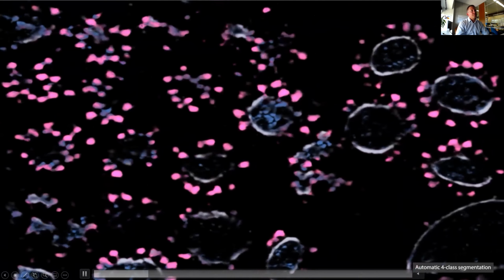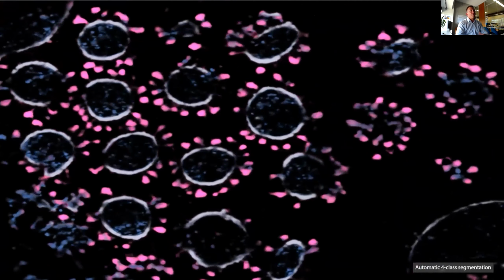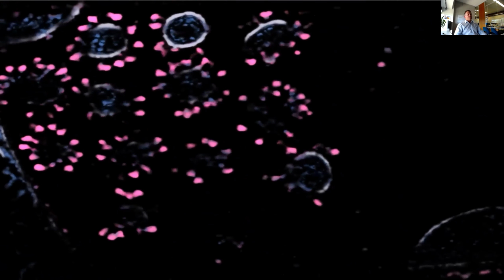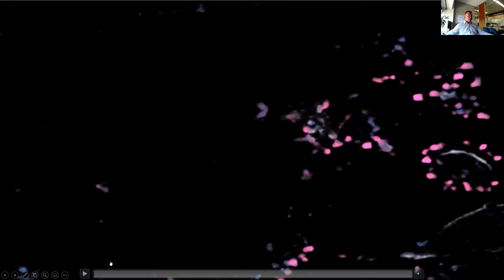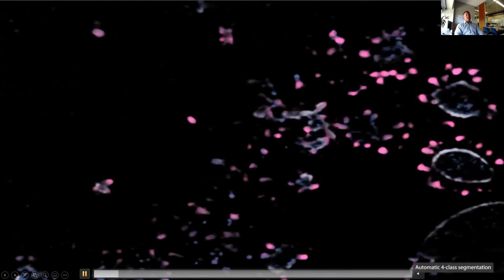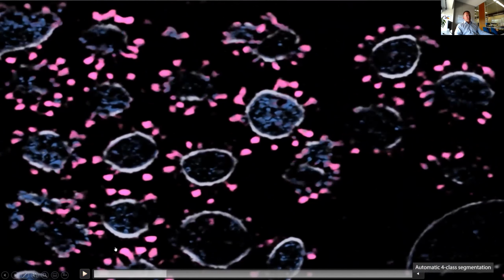Afterwards, this is an application of the segmentation on a novel set from these acquisitions provided by Tsinghua University. We can see that the segmentations are actually better than the pseudo labels which we have seen before. This has also been confirmed by the domain experts, who mentioned the missing wedge problem. So I have to stop here.